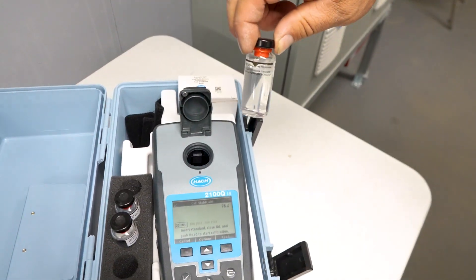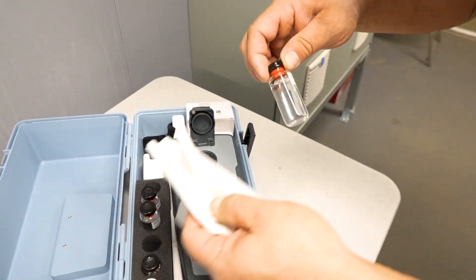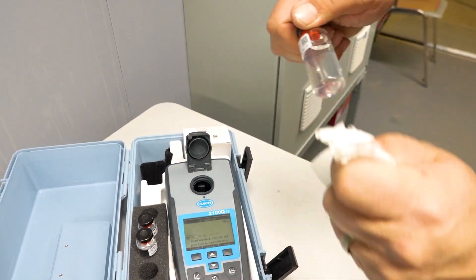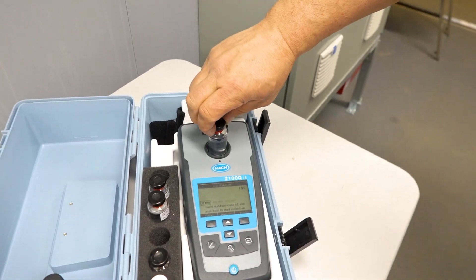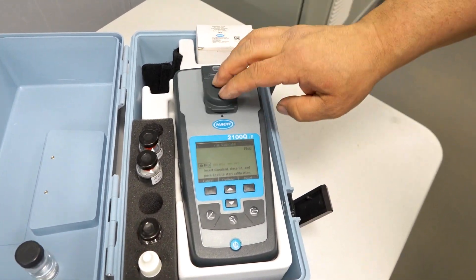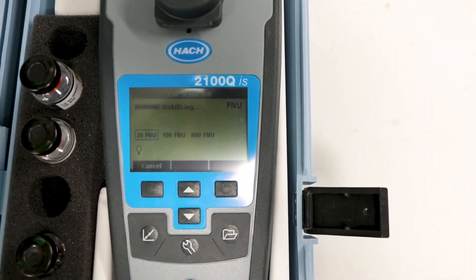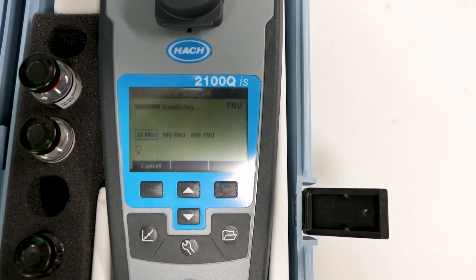Once it's done that, you've got to polish your cell, put it in arrow to arrow, close your lid, and hit read. And then once it's done stabilizing, it'll ask for the next cell.